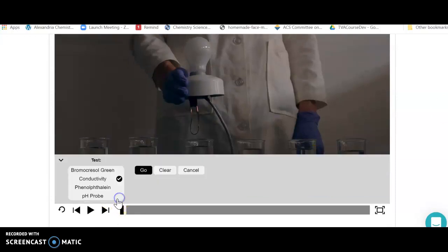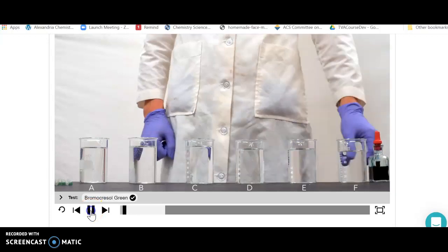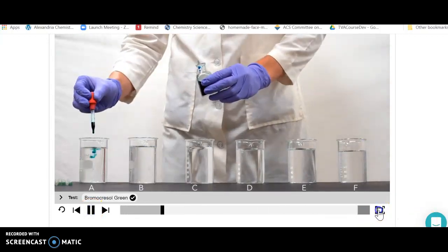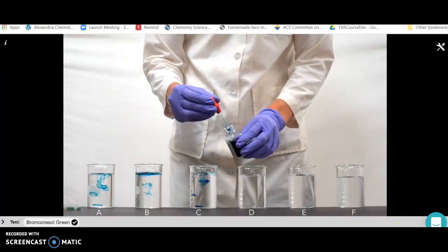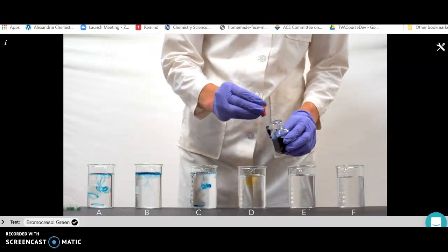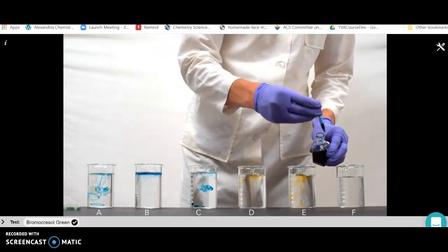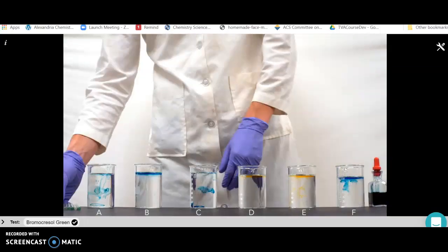What you're going to do is select which test you want to do. For example, I'm going to pick bromocresol green and press go here, and then play. Remember, all of these work a little better if you expand the screen. What they're going to do is put some of the indicator into the solutions.